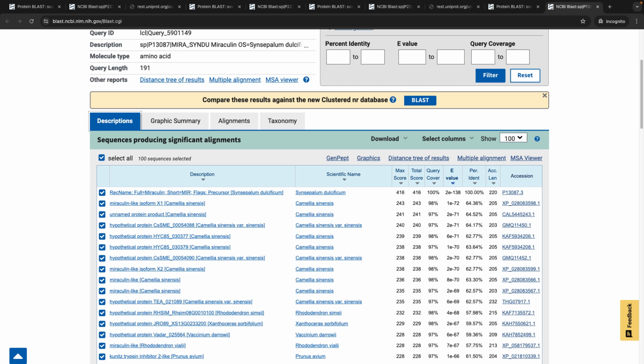Next, coming to the paralogous sequences. Paralogous sequences are homologous sequences within the same species that arose from gene duplication events. So we have to look for sequences within the same species with high similarity but which may have diverged to perform different functions. So in this, we have to look for the proteins from the database which have higher percentage sequence identity, and are from the same organism. We can claim those as paralogous sequences.